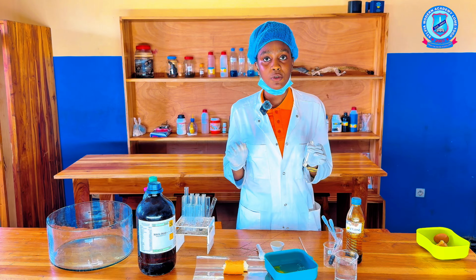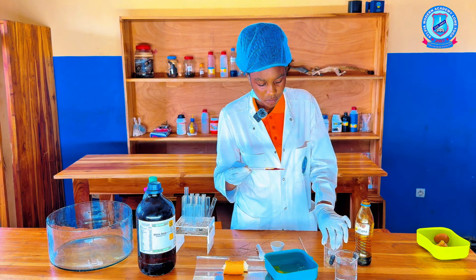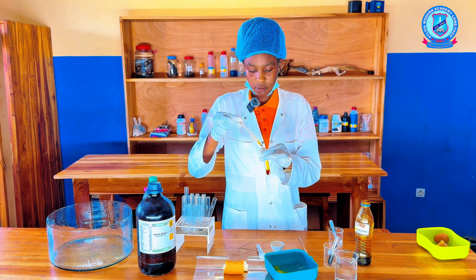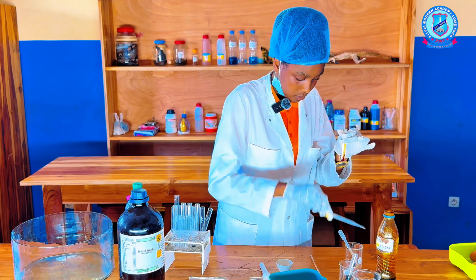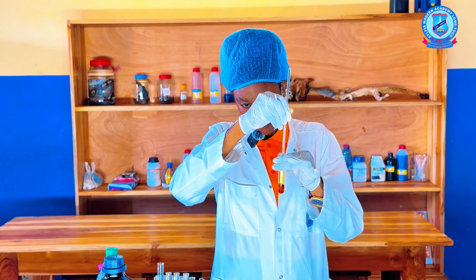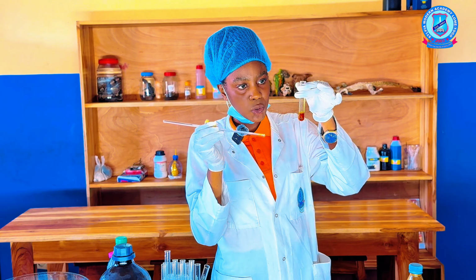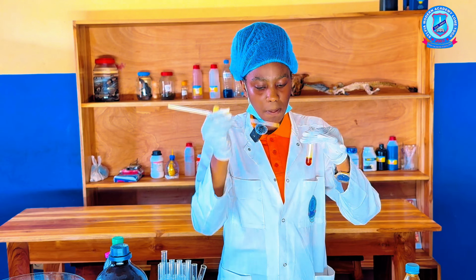So we're going to add a few drops of iodine solution into the test tube. We are going to stir this sample together. You can see that there is no color change in this test tube. So let us compare.